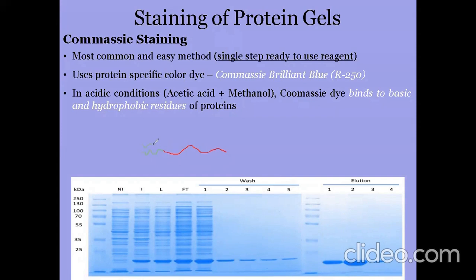Now we have multiple of these proteins, if I could draw here. We have different proteins, and we need to purify this very specific recombinant protein from a mixture. It has a histidine tag. This histidine tag has affinity for, as we have already talked about, nickel or any metallic component. So we have nickel here.